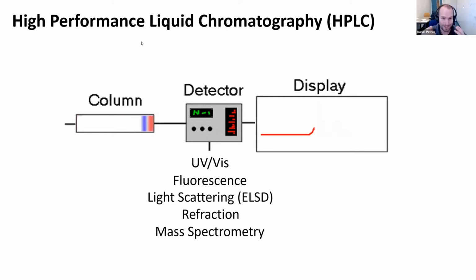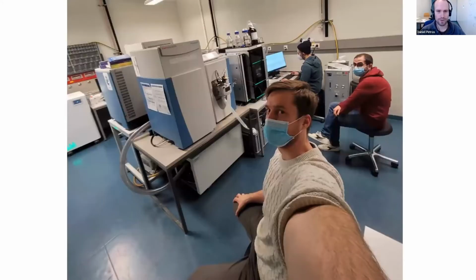And then for us, most importantly, mass spectrometry is widely applied now as a detector for HPLC, or if you do high-end mass spec, then maybe your HPLC is more the sample introduction system, but I leave that up to you.